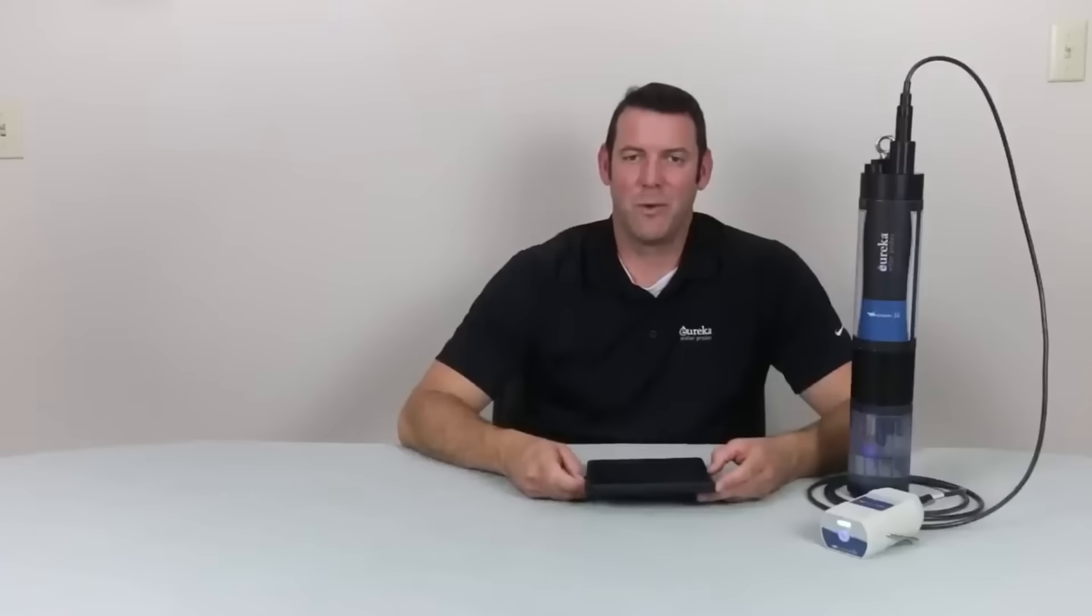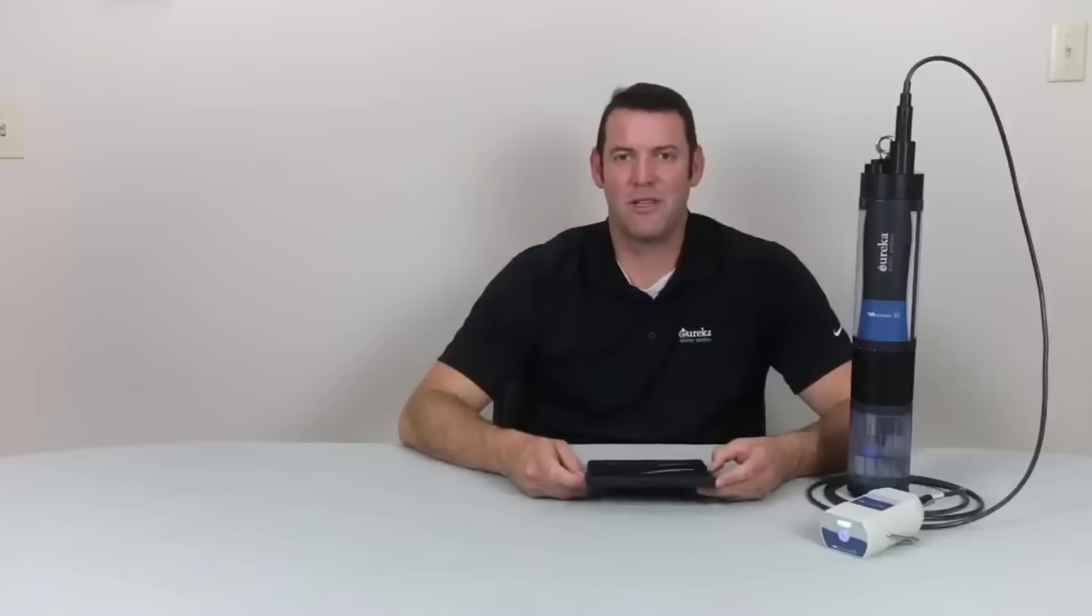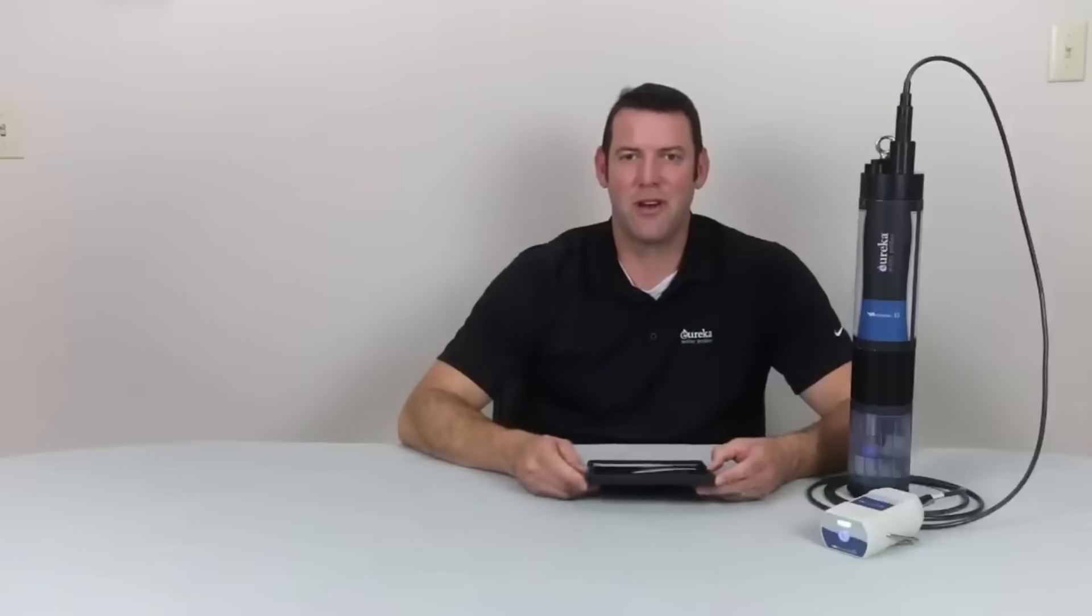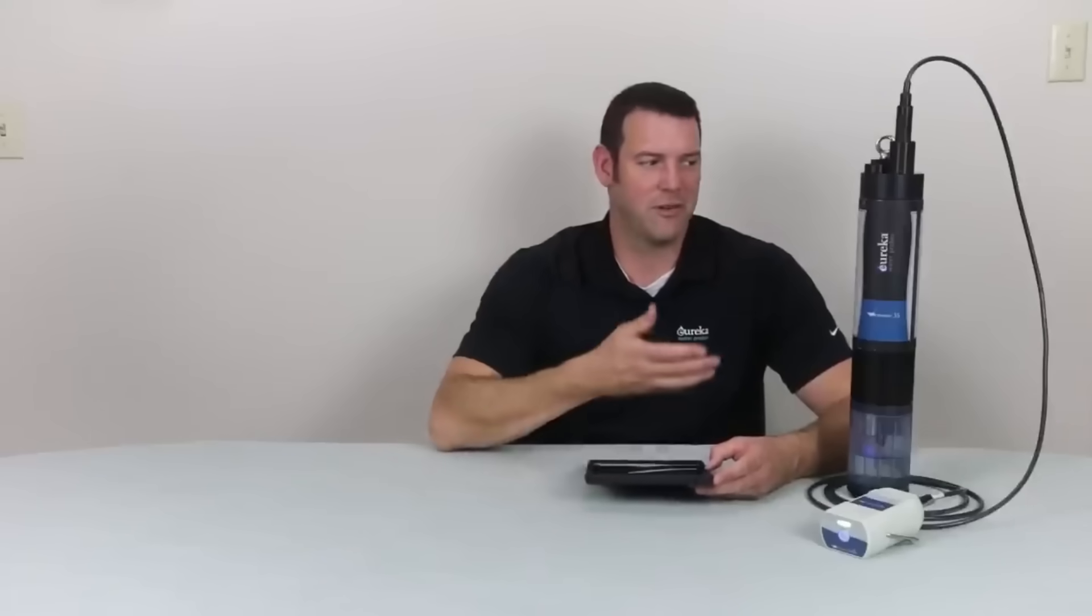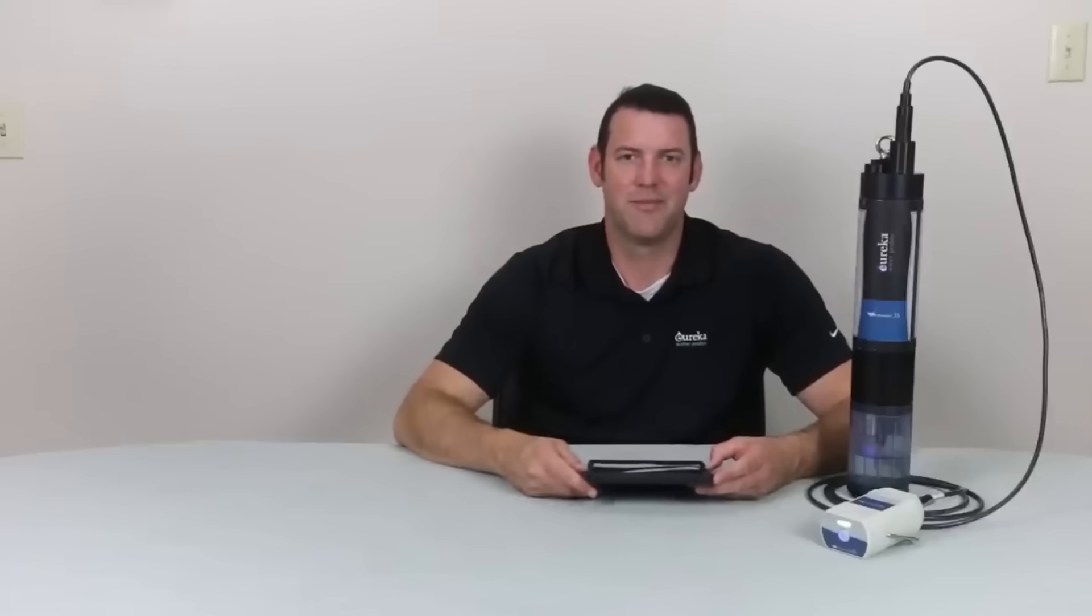Welcome back everyone. We're continuing with our next segment of the instructions on how to use our MantaLink app. We're covering calibration next, so we're going to calibrate our conductivity sensor on this multi-probe.